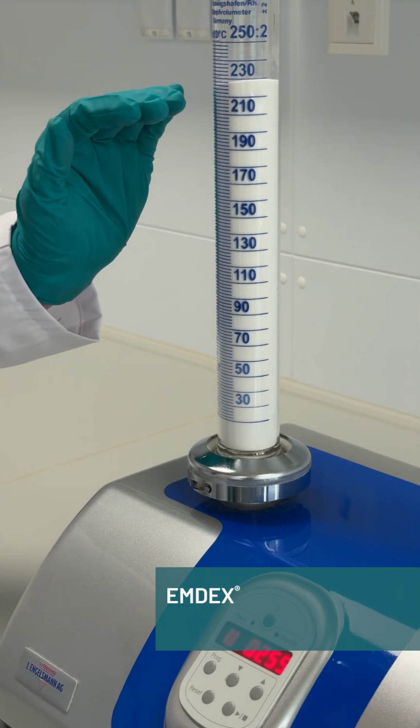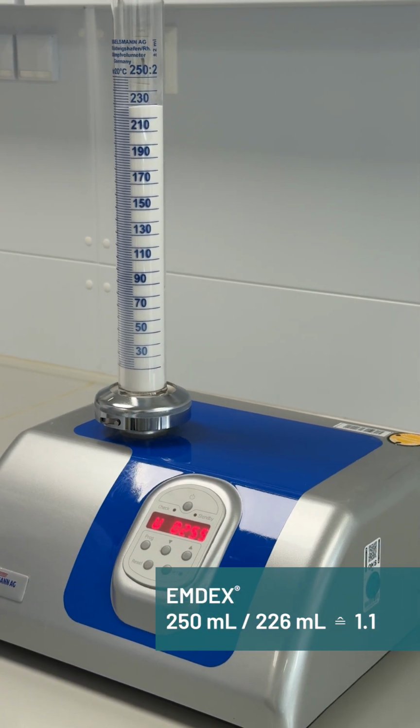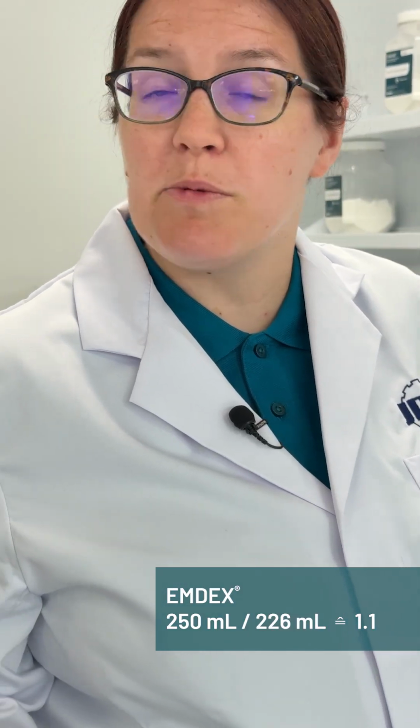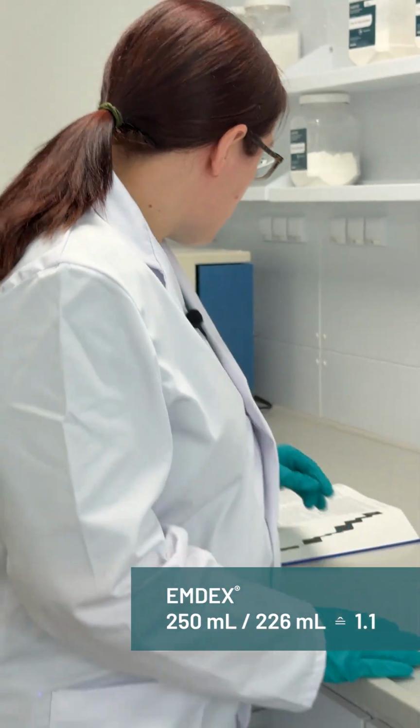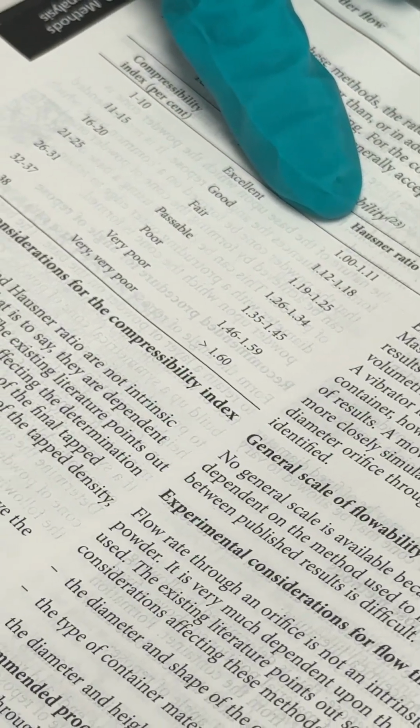The weight's what really matters for the tap density measurement. And now we can see that the reading is approximately 226 milliliters. 250 milliliters, our starting volume, divided by 226, gives us a Hausner ratio of approximately 1.1, which is just on the borderline between good and excellent according to the pharmacopoeia.